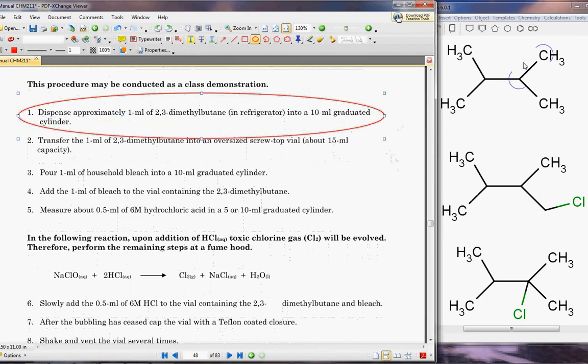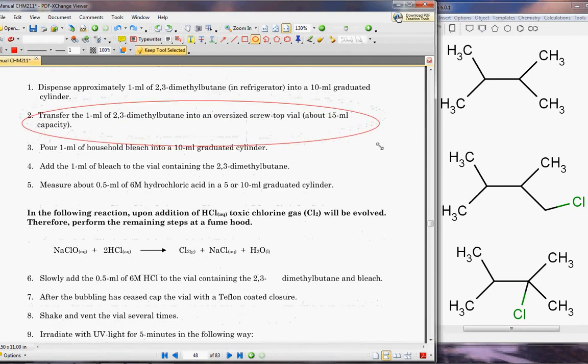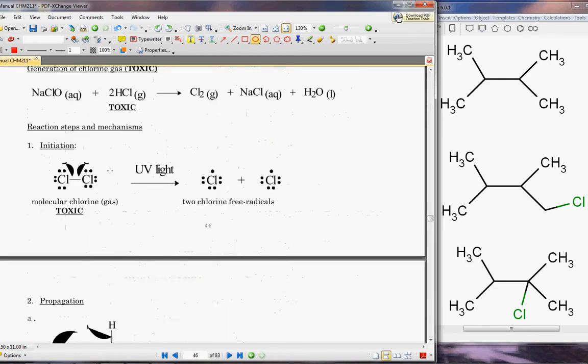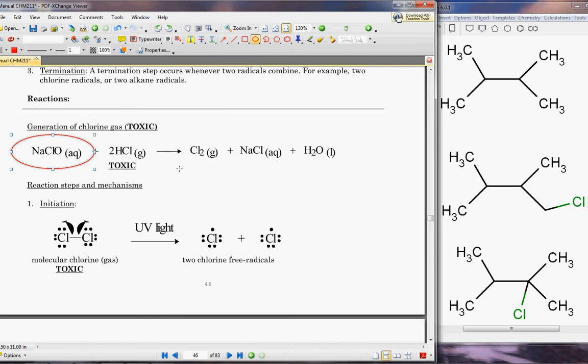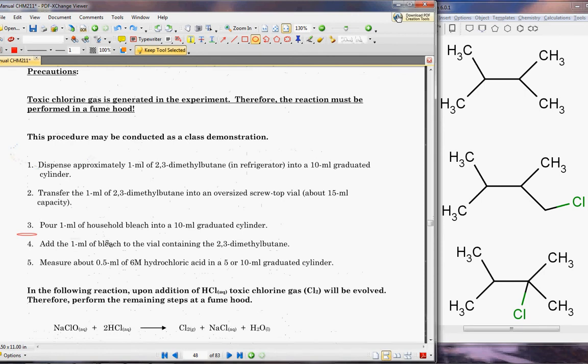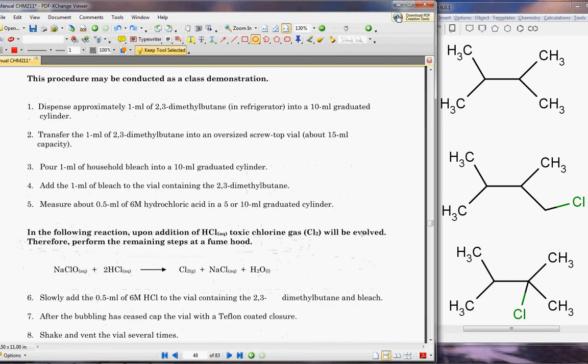Our first procedure is we're going to dispense some of this dimethylbutane, which we have right here in the fridge, into a 10 milliliter cylinder. We're then going to transfer it into a screw top vial where our reactions are going to take place. We're going to add one milliliter of household bleach to the dimethylbutane.